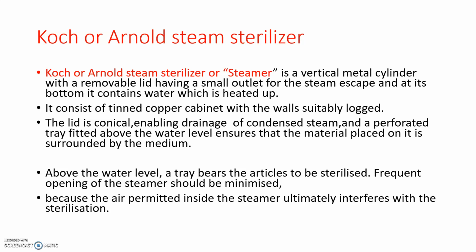And above this water level, the articles are kept on the tray. The tray is kept above the water level. During this procedure of sterilizing, the frequent opening of the steamer should be minimized, because when the air is permitted inside the steamer, it ultimately interferes with the sterilization.